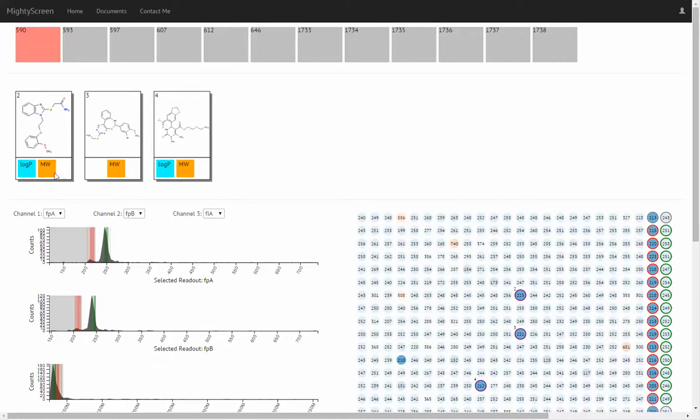And then there's another coding here called logP and MW. These are 2 properties that indicate whether the chemical has drug-like properties. So logP relates to the overall lipophilicity of the compound. If it's less than 5, it means the compound is drug-like. And for molecular weight, the rule is that a molecular weight lower than 500 means a better compound that is more suitable for drugs. So you can see these 2 compounds are really good, but this one is not so good.